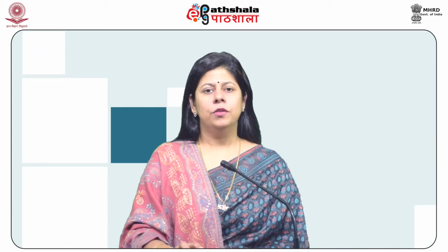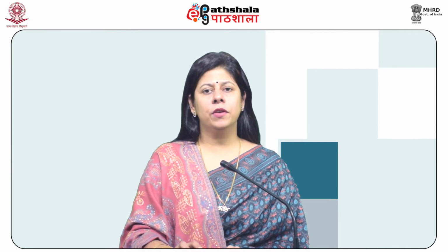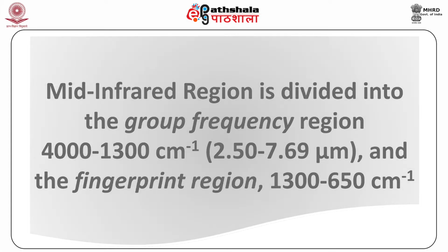Mid-infrared region. Numerous practical correlations have been found in the mid-infrared region. This region is divided into the group frequency region, that is from 4000 to 1300 centimeter inverse, and the fingerprint region, which is from 1300 to 650 centimeter inverse.